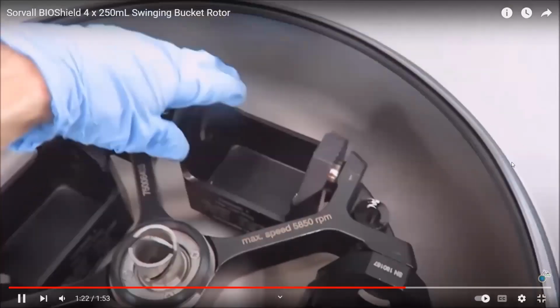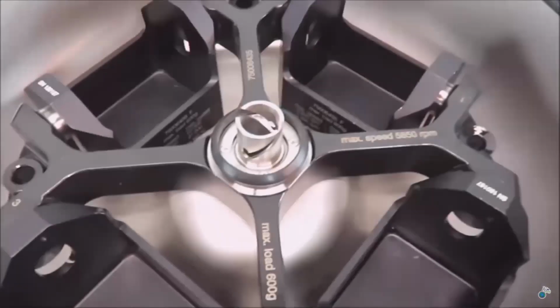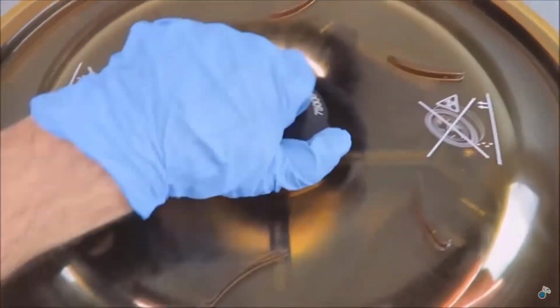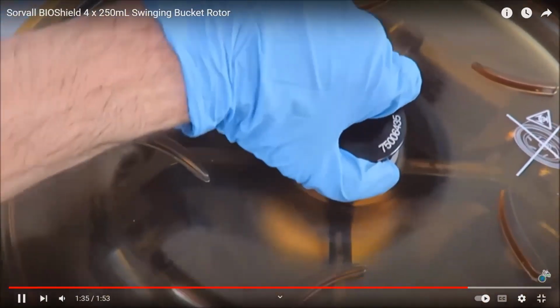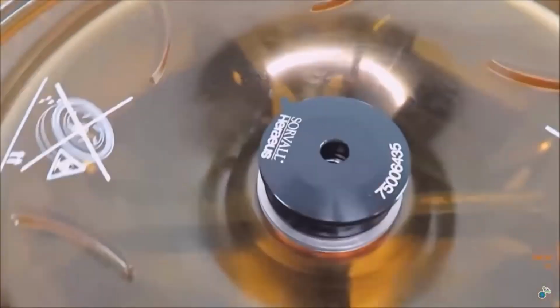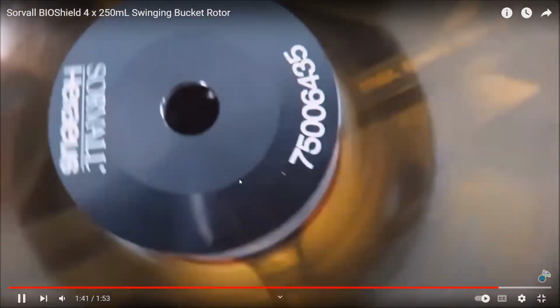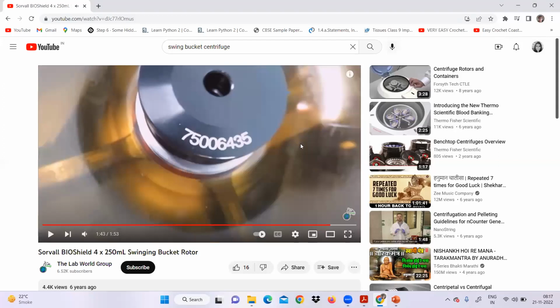So these are the swinging buckets. Whatever he's showing, it's a swinging bucket type of rotor. Okay, so that's how swinging bucket, and these are very updated.